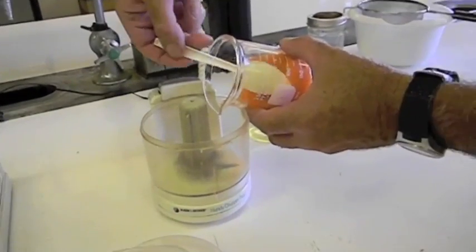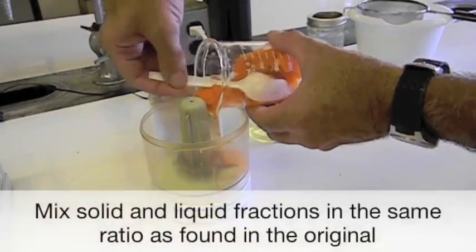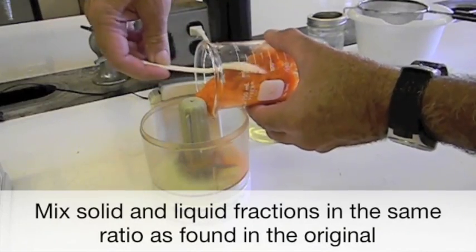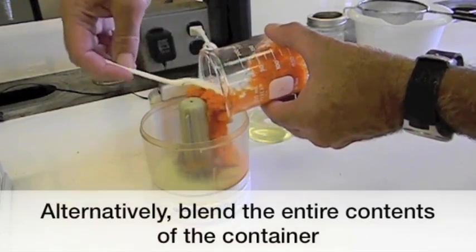To determine the final equilibrated pH, mix solids and liquid fractions in the same ratio as found in the original food.